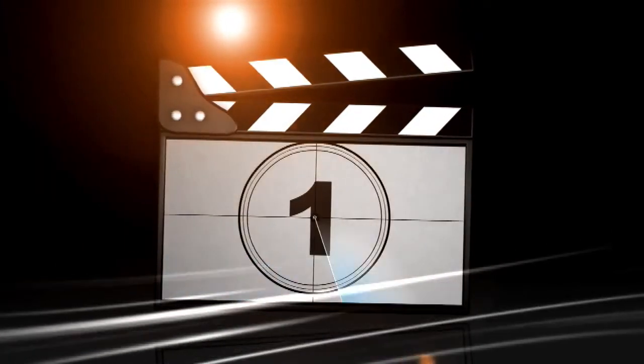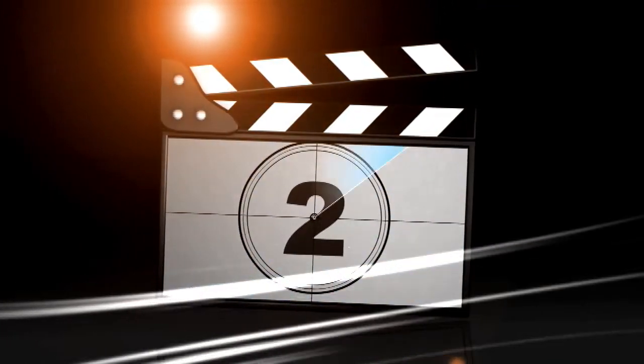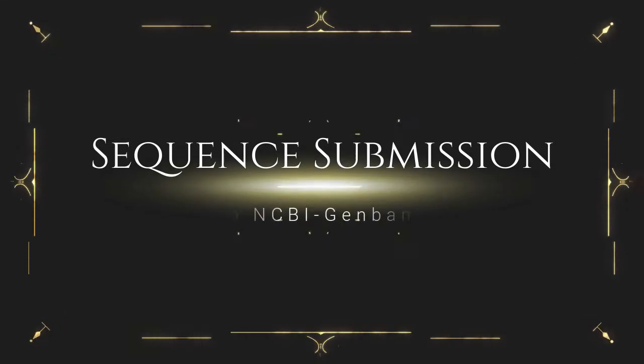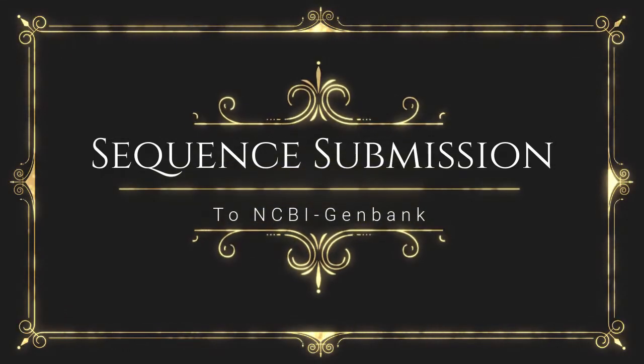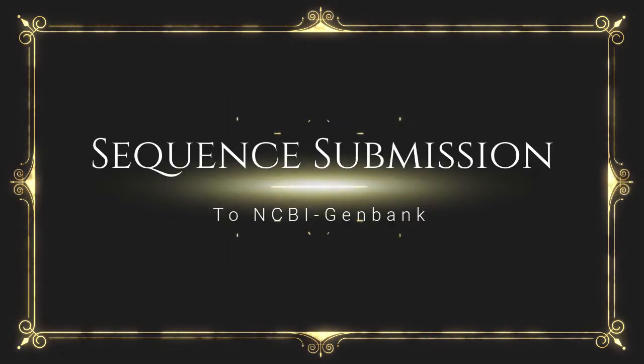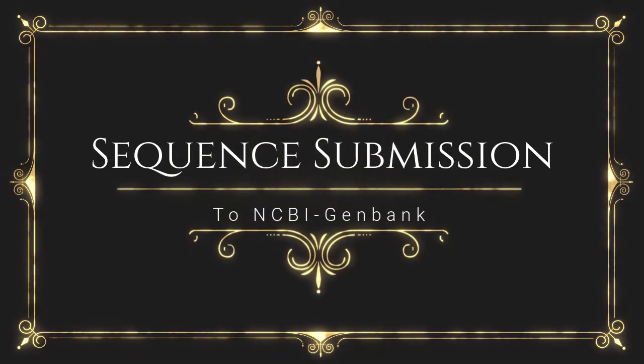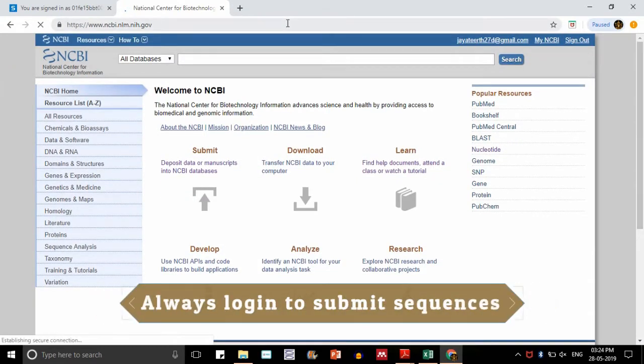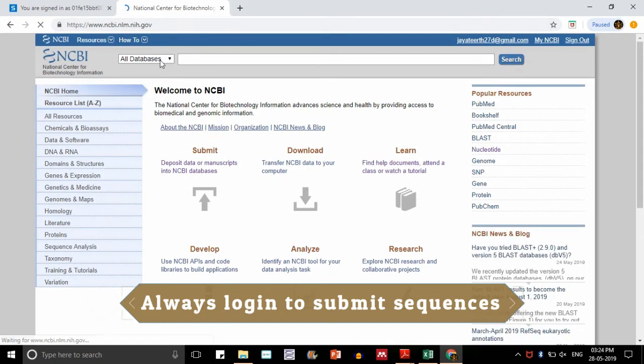Hello everyone, welcome back to JS Biology. In this video we learn about sequence submission to NCBI GenBank. Let's go to the home page of NCBI GenBank, probably just NCBI.